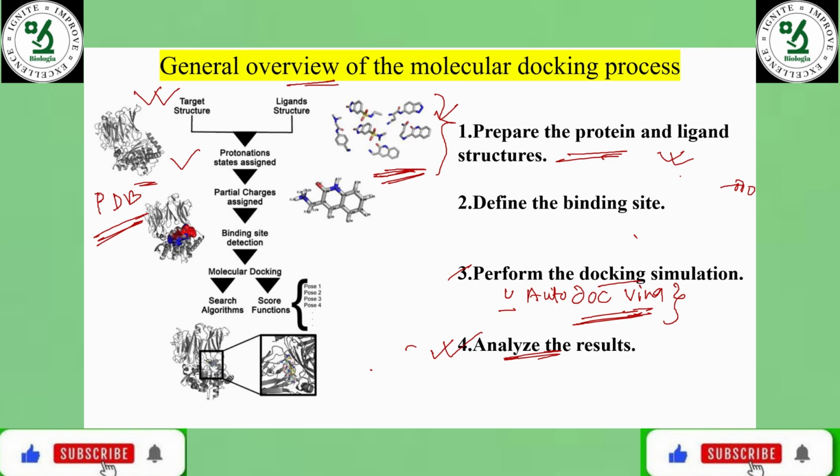Further, the results are analyzed in PyMOL or Discovery Studio, or many other tools or software are used to analyze the result and also the structure prediction among the various poses found after docking. So this is the general overview of protein and ligand interaction.